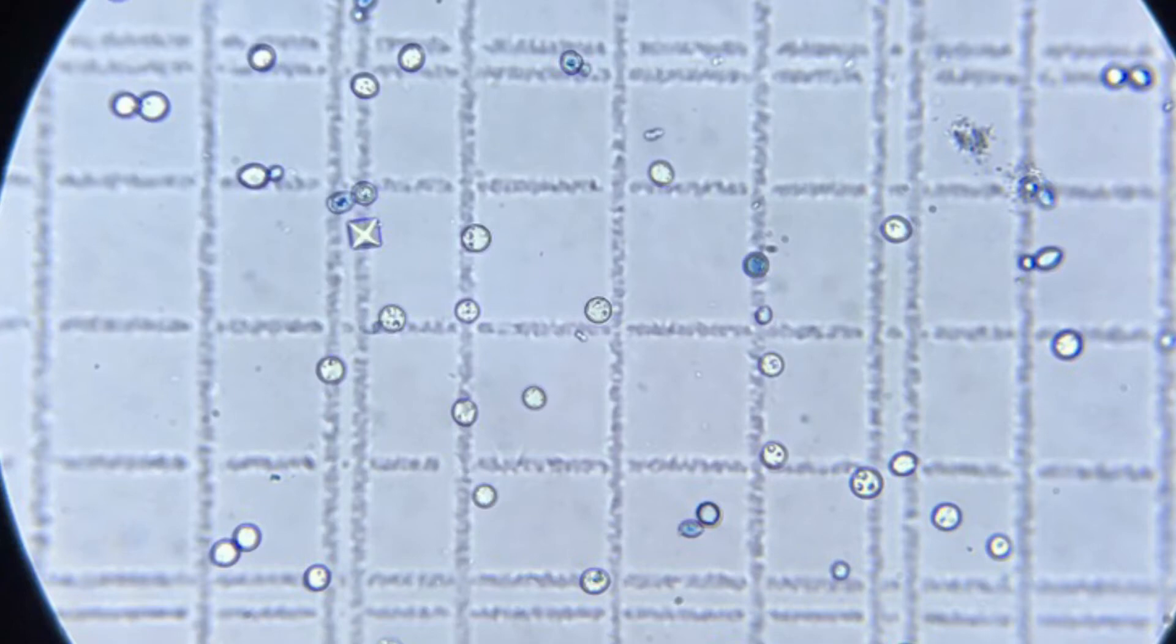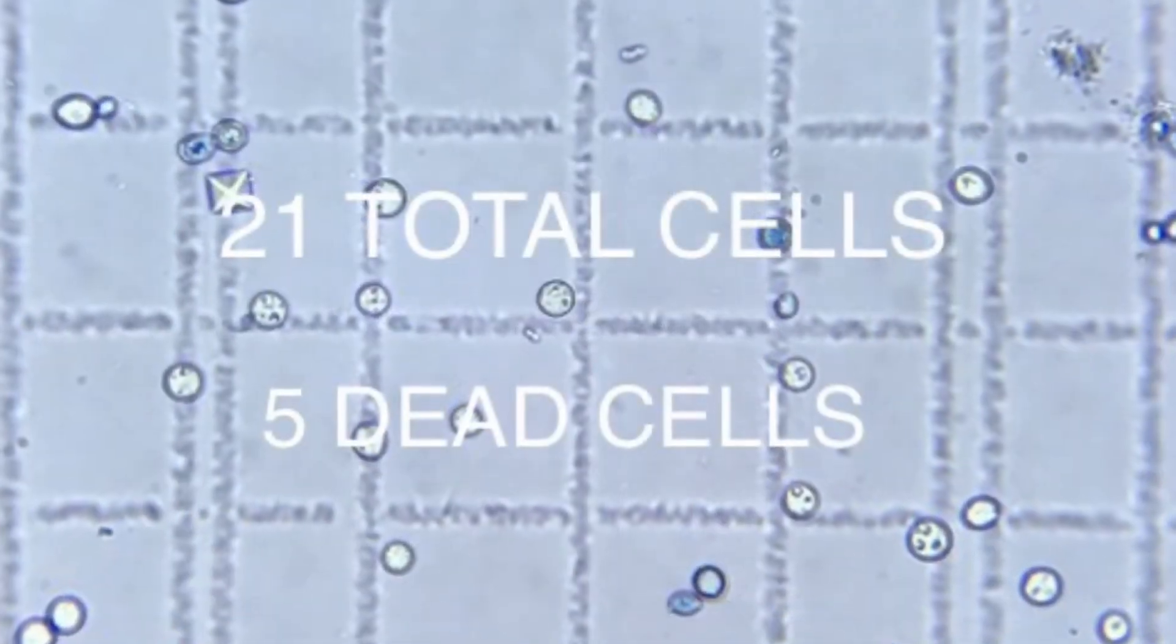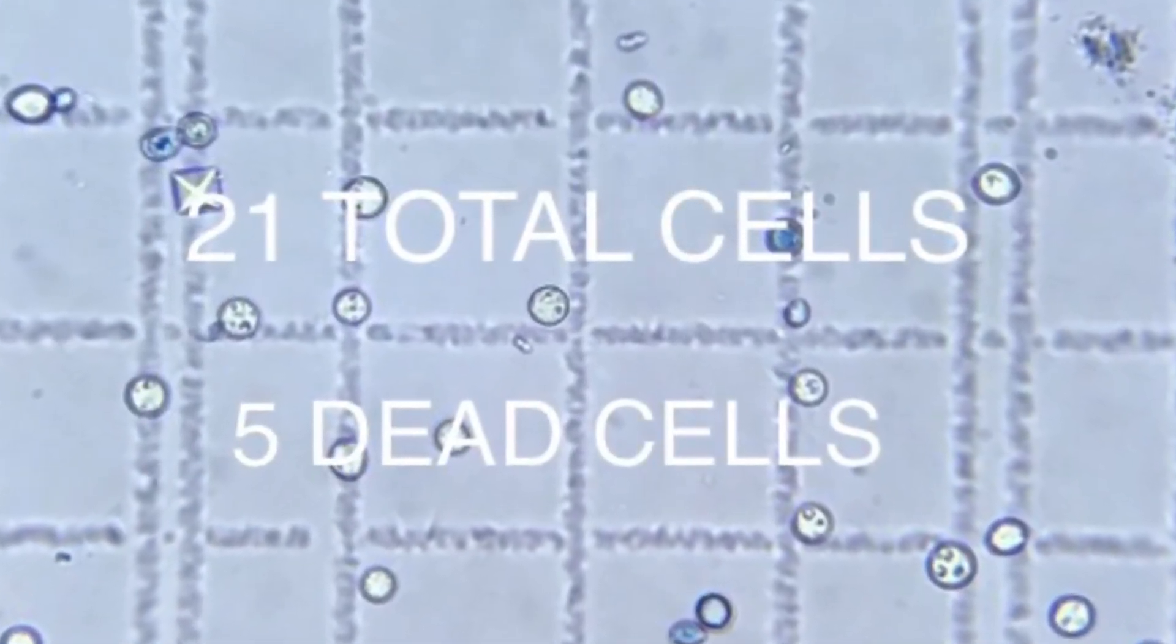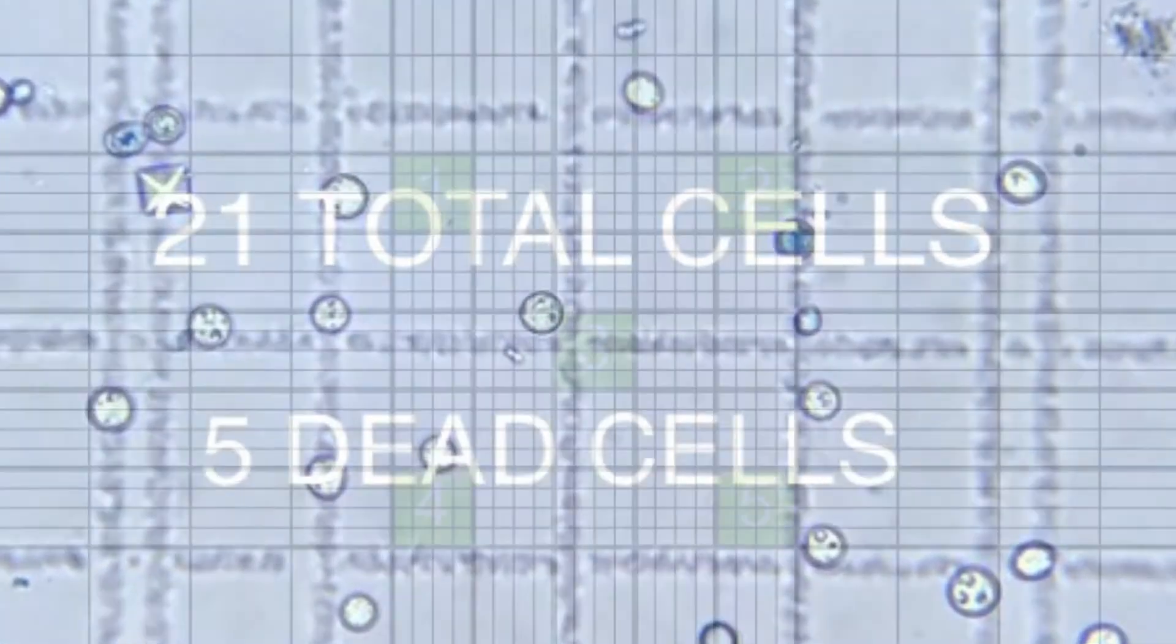So for the first grid in our count, I counted a total of twenty-one cells, with five of them stained blue. Now we repeat the process in the opposite corner.